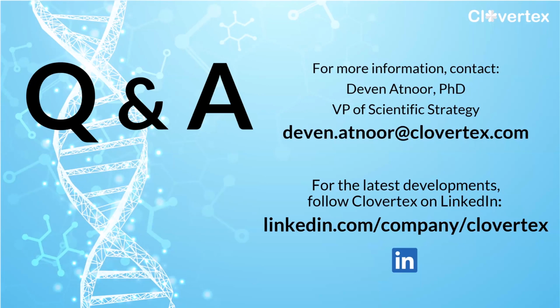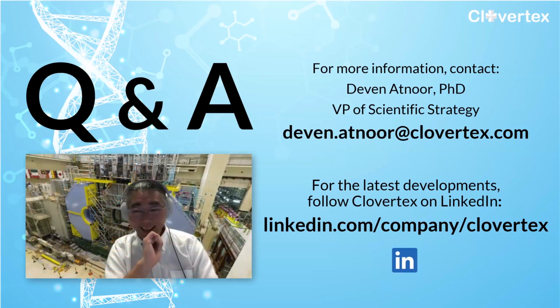Great, thank you. Another question: is centering of particles automatically optimized? How is it done? We haven't, and that's a problem. At this point, the best way to center the particles is using either 3D classification or 3D refinement, because I believe the best center of the 2D image is the same as the center of the 3D.